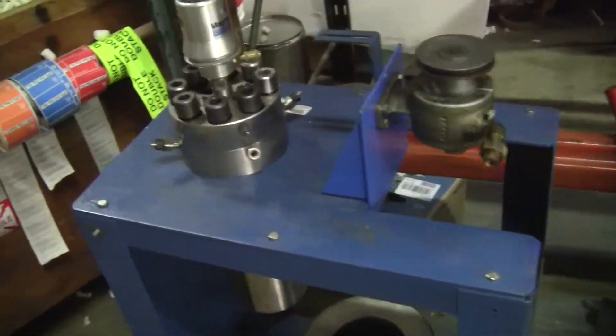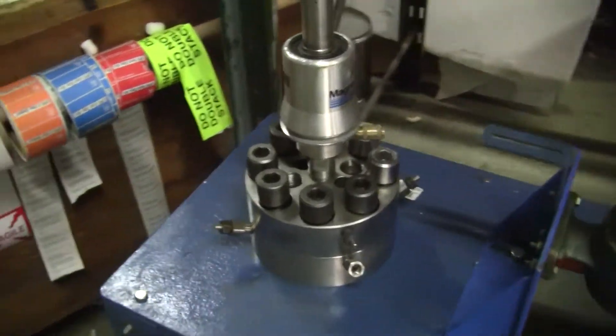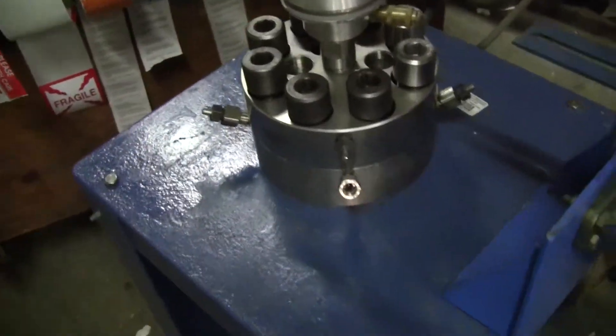Good morning, this is Michael Natow from Hitech Trader. Today we're looking at an autoclave engineers reactor. It's a two liter. Really quickly we're going to start on this one side here.